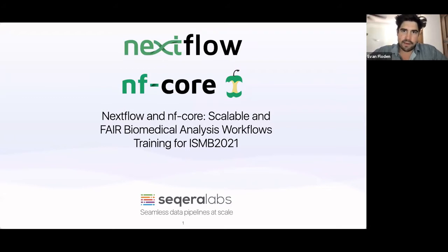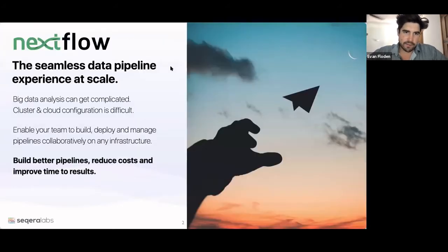We're mainly going to talk about Nextflow today. And Nextflow is a workflow manager. Hopefully you have heard of it, or at least are here in the right room to find out a little bit about Nextflow. So we're from Seqera Labs, and we're a spin-off from a university who created Nextflow almost 10 years ago now.